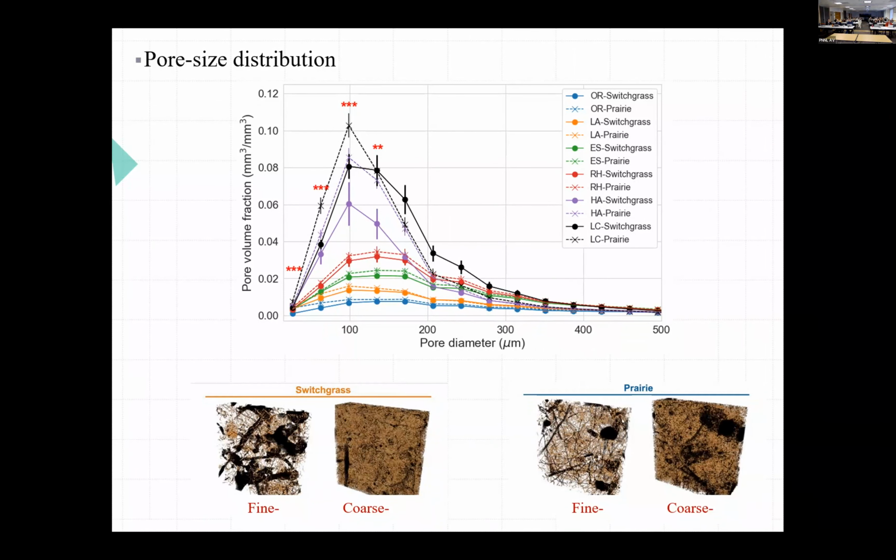Why I'm saying this when showing you this graph is because you're probably looking at the low volume of pores of the smallest size.